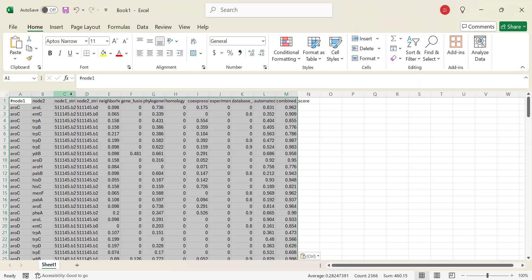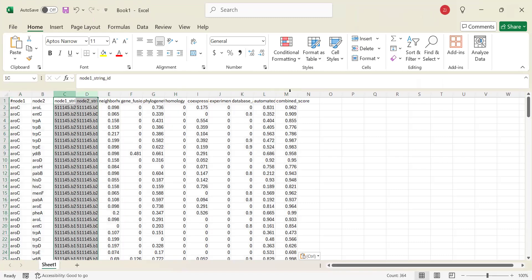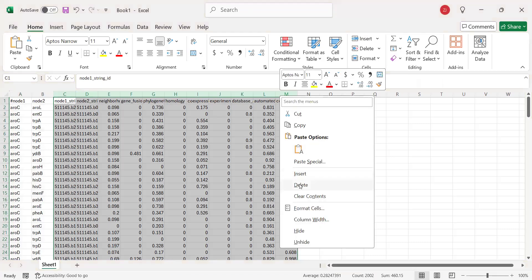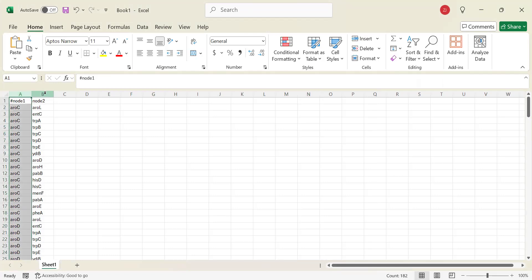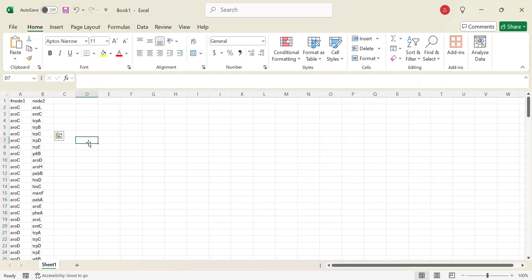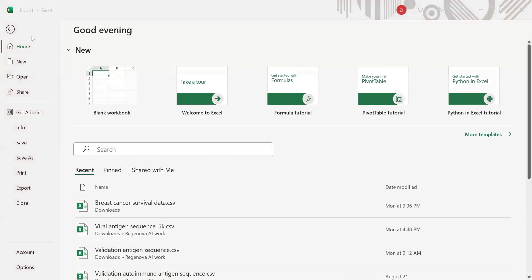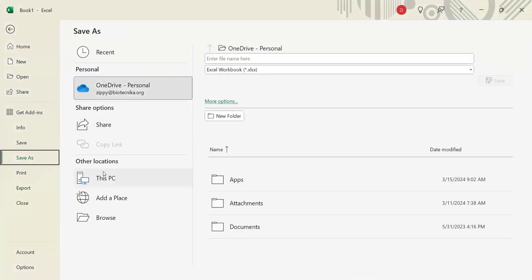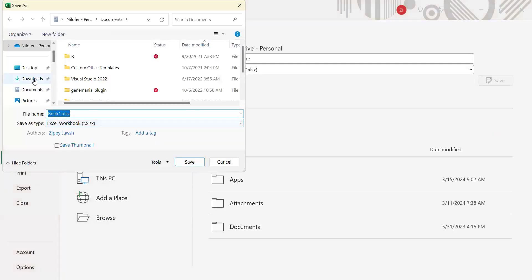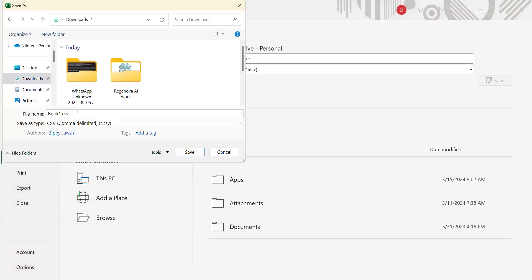We have node 1 and node 2 right here. Node 1 will have interactions with node 2 — that is what we are going to see. Now I'm going to save this file. You have to save it as a CSV. I'll go to Save As in Downloads and name it network.csv.